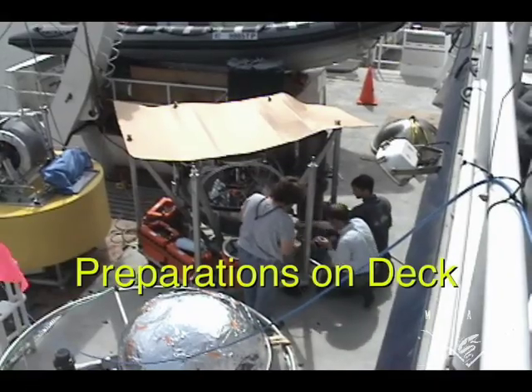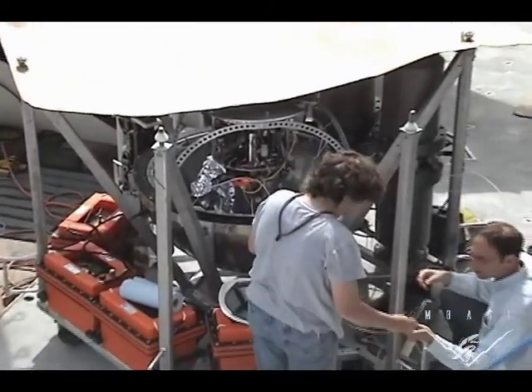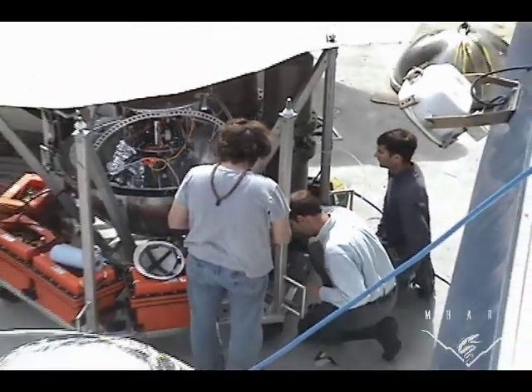We are getting ready to go to sea here, and we have three engineers that are working on the deep ESP. That's the ball with the top half removed — there's the ESP inside of it — and they're doing some testing to test its communications.